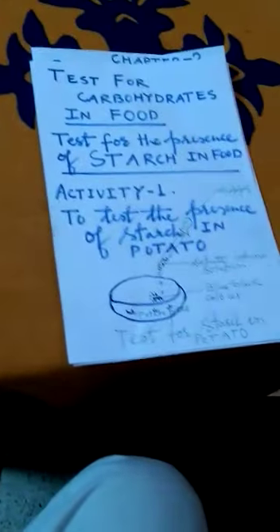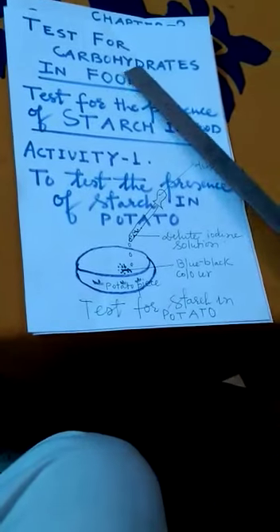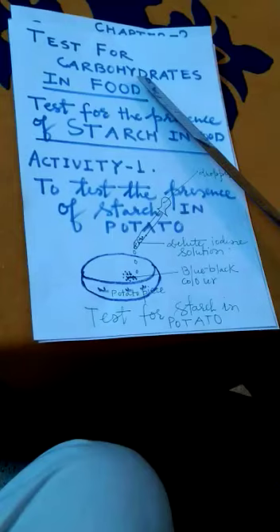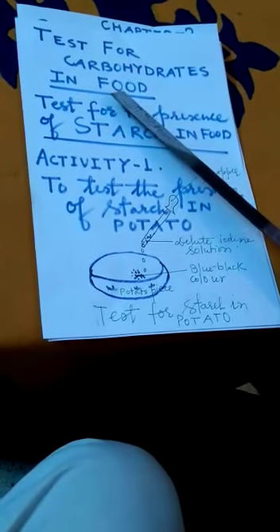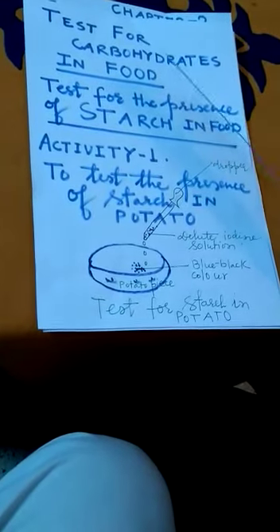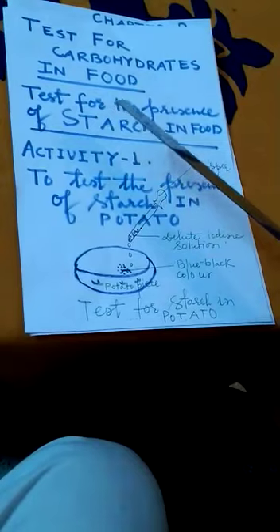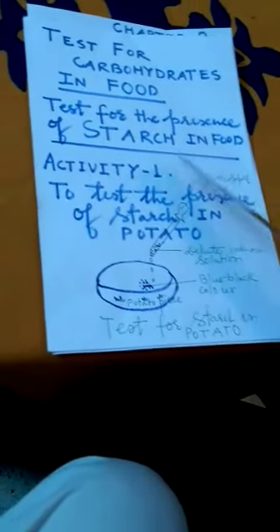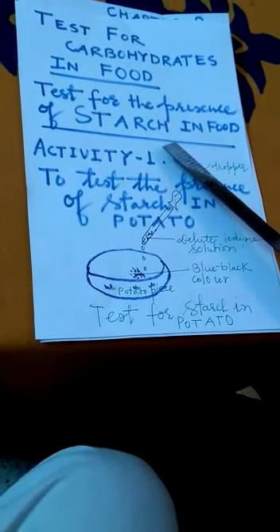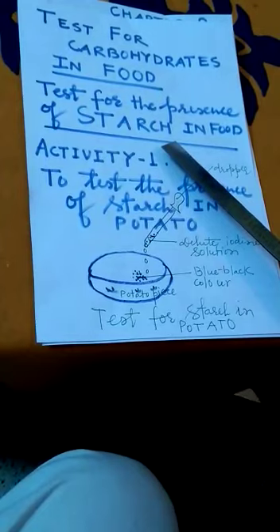So first we will go to the test for carbohydrates in a given sample of food. The most common carbohydrate in our food is starch. So we will perform a test to detect the presence of starch in a given food item. So what should we do to test for starch?